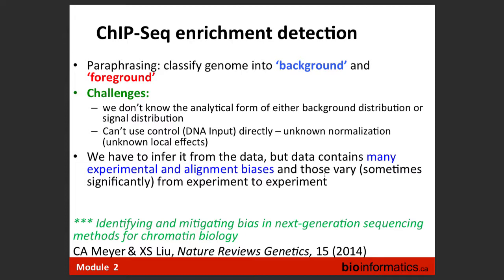No, we cannot. The reason why we cannot is, first of all, input is still a slightly different experiment. So the background is somewhat different. What will be another argument why we can't use input directly, comparing our IP to input? Because our depth of sequencing is different. Our total number of reads, we don't actually know.